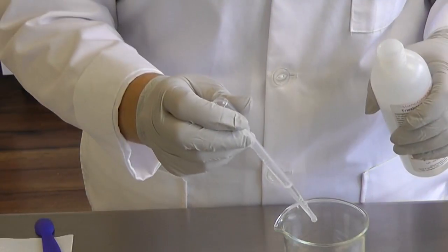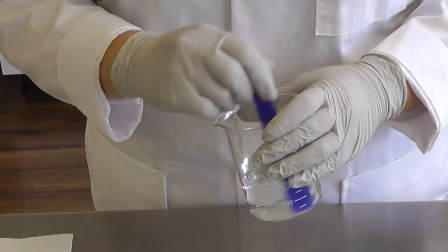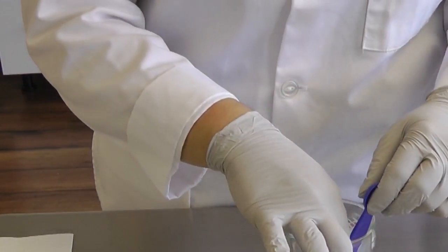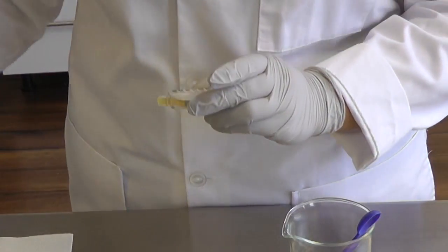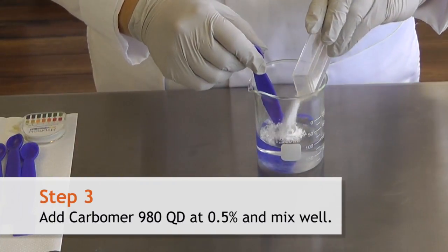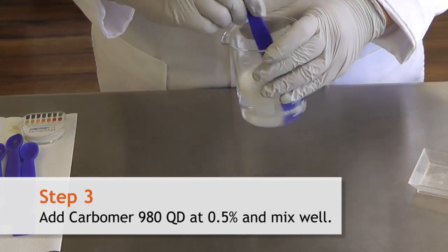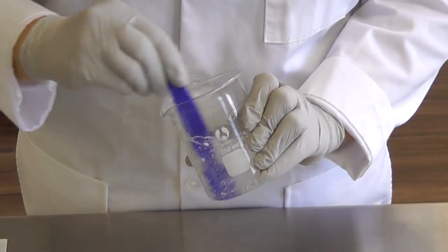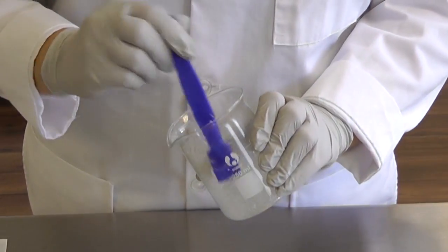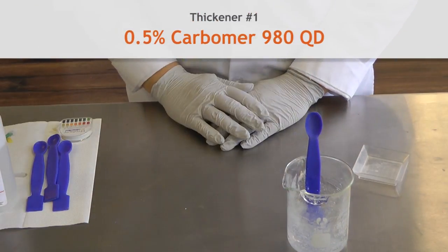Add three drops or so of triethanolamine. Our water is now about a pH of 7, so we can go ahead and add our Carbomer. With a little bit of stirring, we're able to make a very very thick gel. This is a 0.5% Carbomer 980.